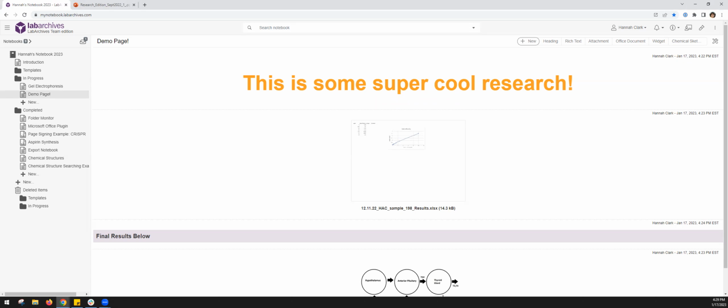There's another good question. This is more of a question regarding compliance to NIH requirements. When files are transferred to LabArchives retrospectively, the date and time will not be the actual date and time of the experiment. Will this still be acceptable in terms of IP? Is there any way to stamp the real date of the file creation?